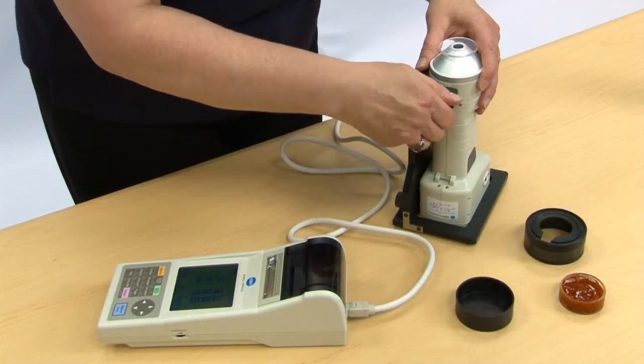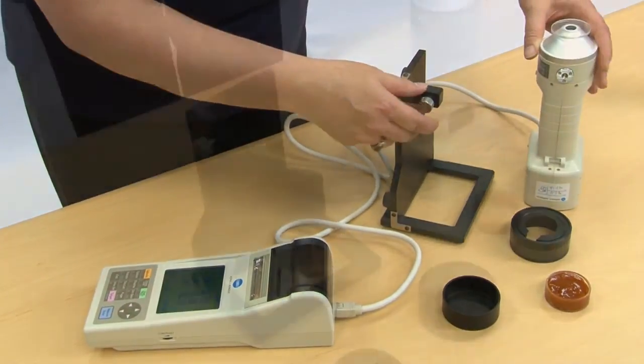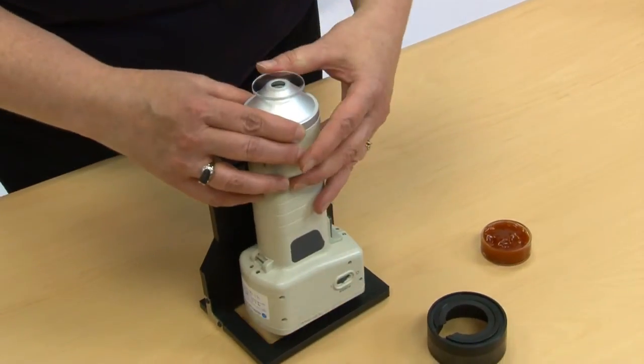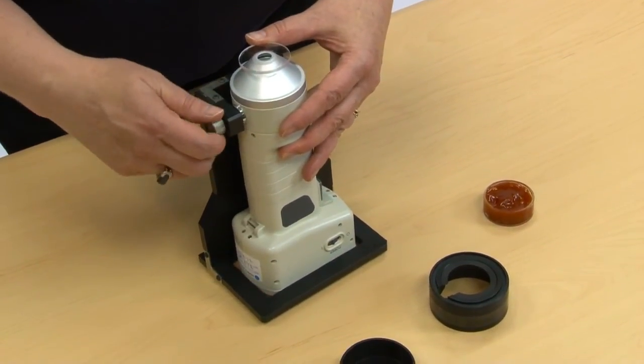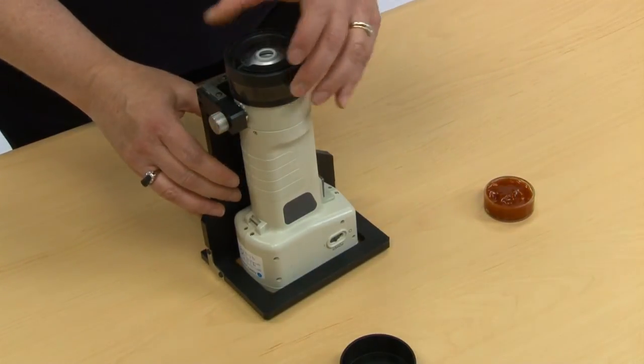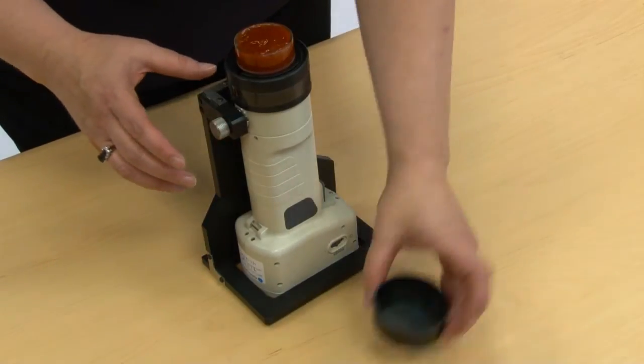The accessory can be used with a data processor attached to the CR400 head, in standalone mode, or connected to SpectraMagic NX. A standard 45mm petri dish is sold separately through Konica Minolta. This is also compatible with the CR400 410 stand, as shown here.